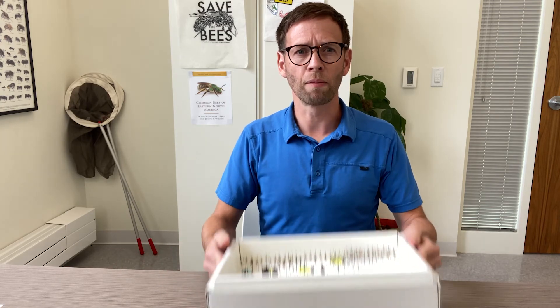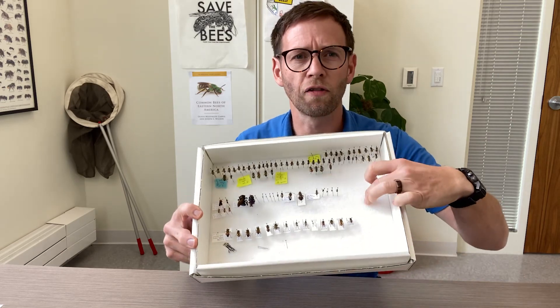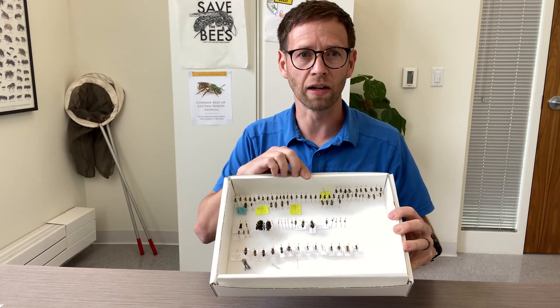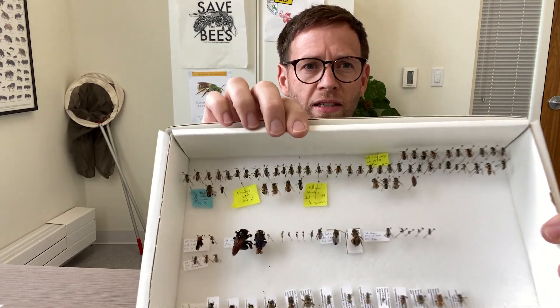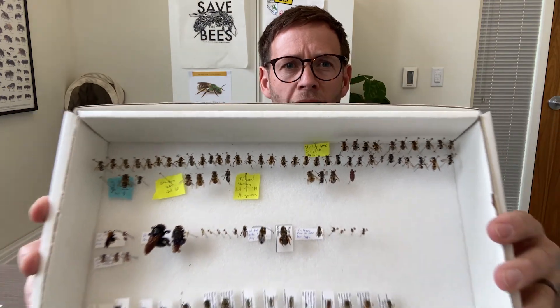Generally when I collect in the summertime, I bring one of these cardboard boxes with me. I get these from Bioquip. They have styrofoam at the bottom, and at the end of the day I will pin the bees that I have collected. This top row of bees is a series I collected on a project looking at pollinators of milkweed.